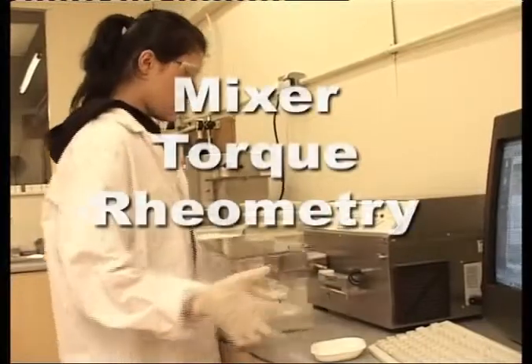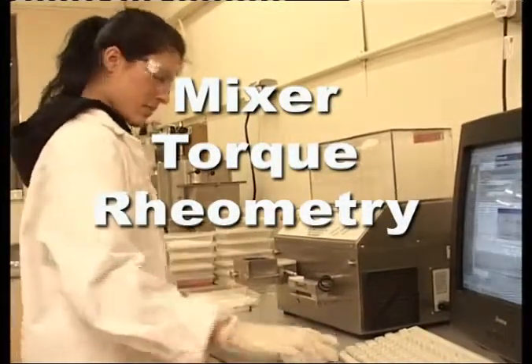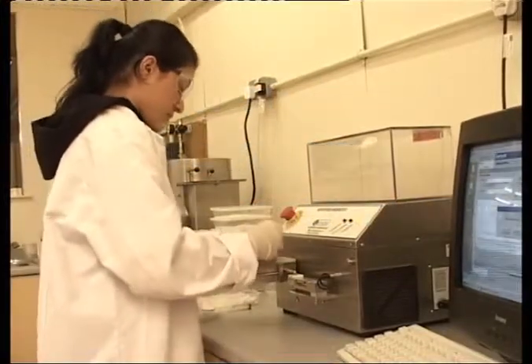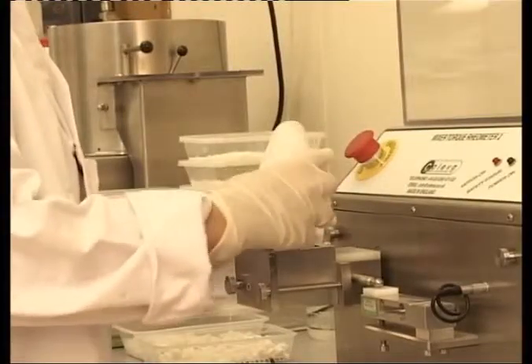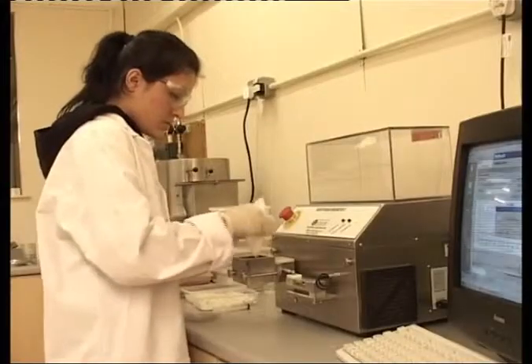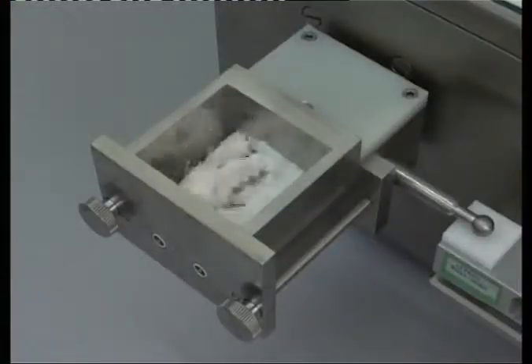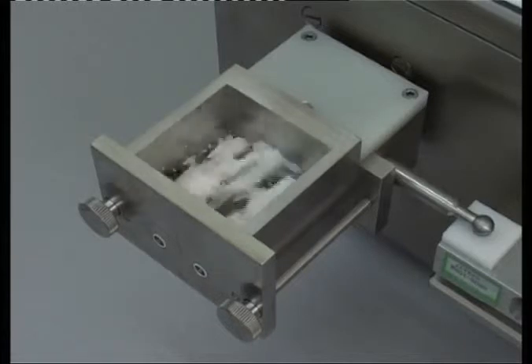Mixer torque rheometry offers a means of characterizing the rheological behavior of wet granulations by correlating the consistency with a numerical value. Mixer torque rheometry is widely used in the pharmaceutical industry as the structure of the wet granulation is not compromised. Consequently, the technique gives highly representative and indicative measurements.